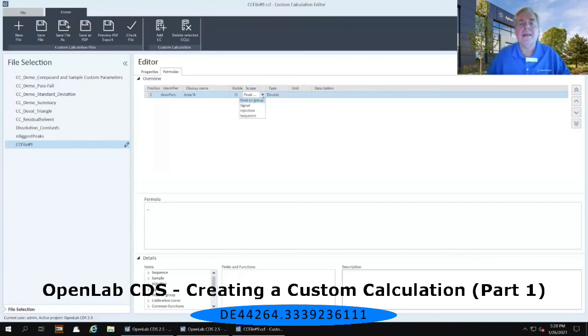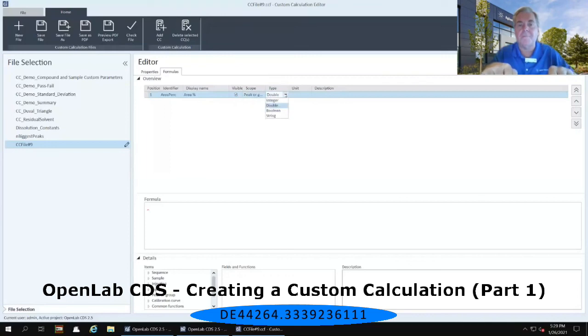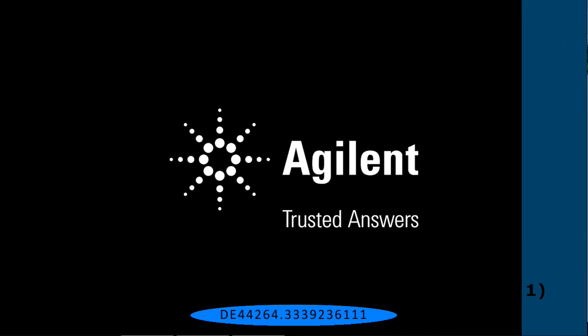Then we have the type here that is set currently to double. That if I use that pull-down menu again, it will show me that I have options of integer, double, boolean, or string.